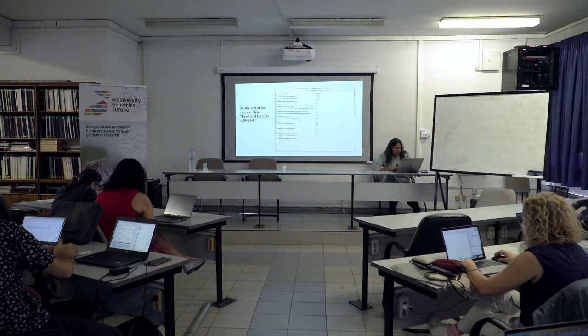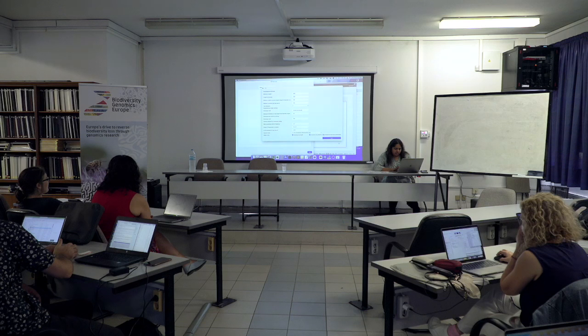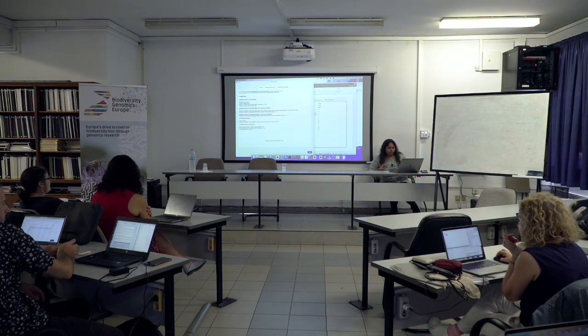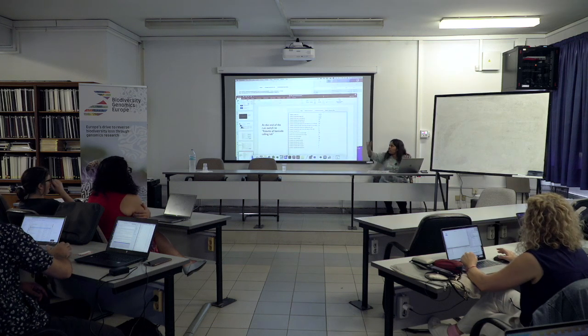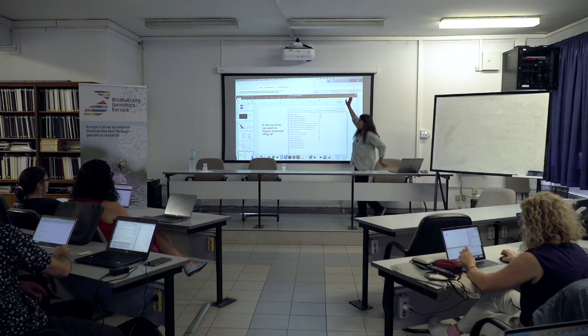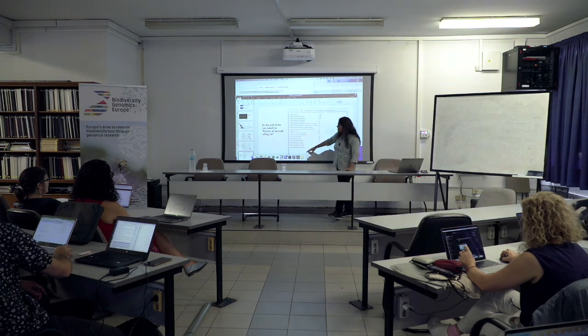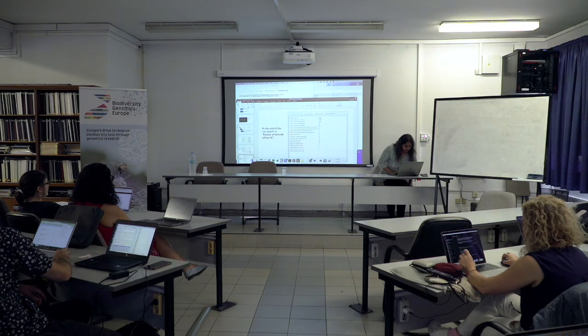Yeah, I can go back to my analysis. I can rerun this and we can show that. So just ignore the numbers here. Please interpret your own numbers. But these are the statistics that you ultimately will get, which basically summarize your run.